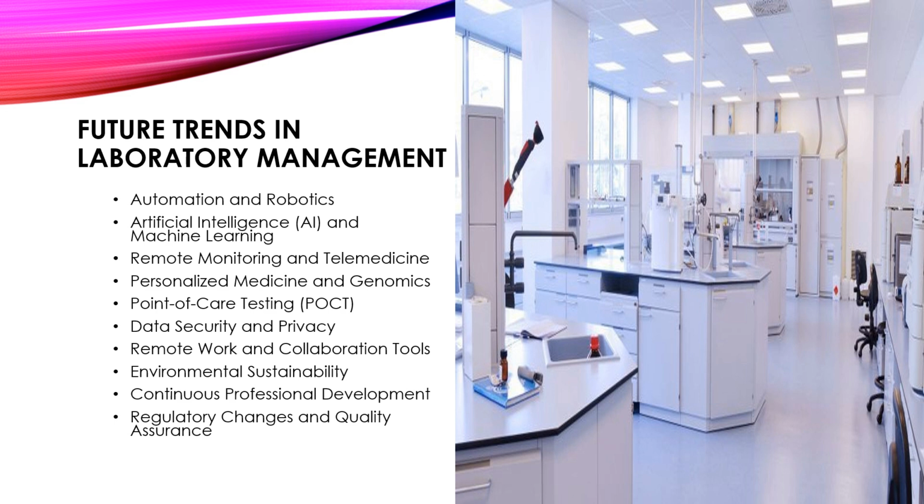Data security and privacy. With the increasing digitization of healthcare data, laboratories will need to prioritize data security and privacy. Compliance with regulations such as HIPAA, Health Insurance Portability and Accountability Act, will be crucial to protect patient information.